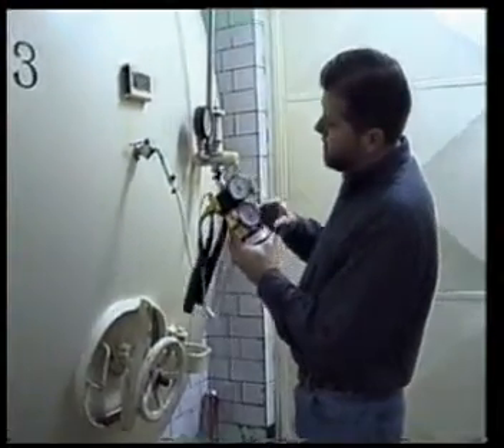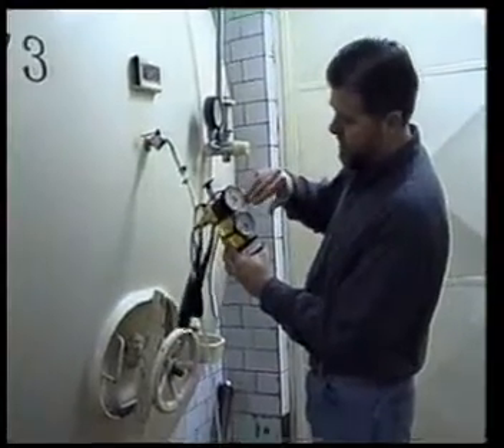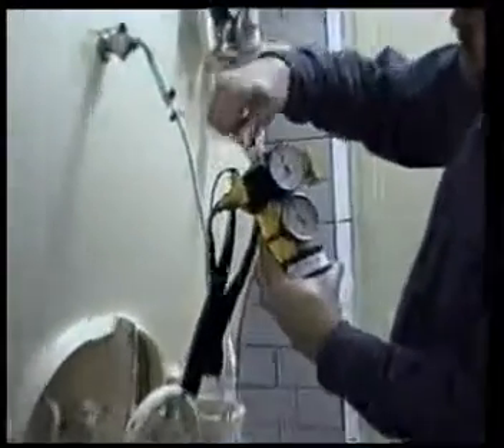Now you have the tank pressure reading here. You need to quickly open and close the output valve so that the excess pressure comes out and you're just reading the pressure of the beer.